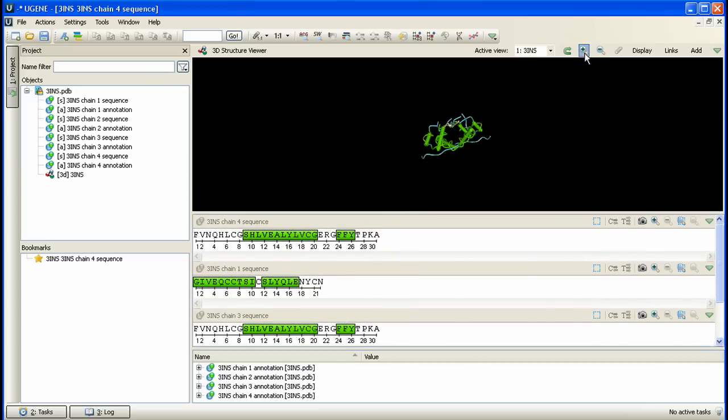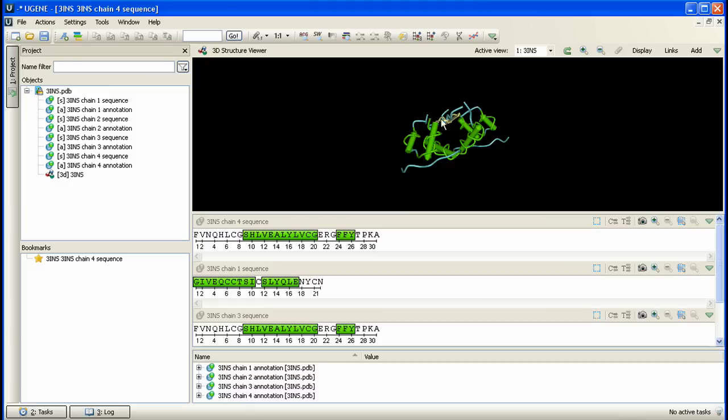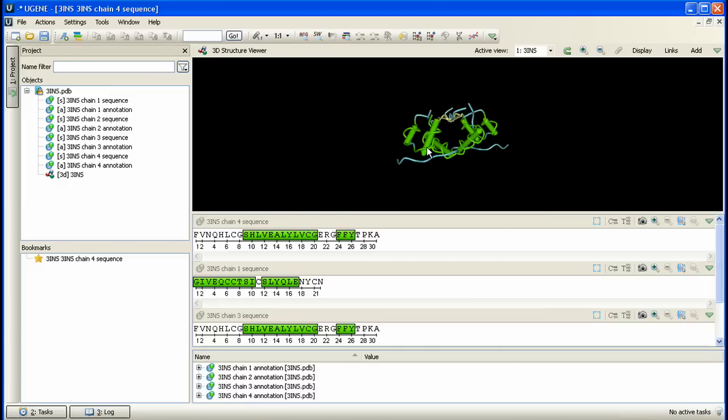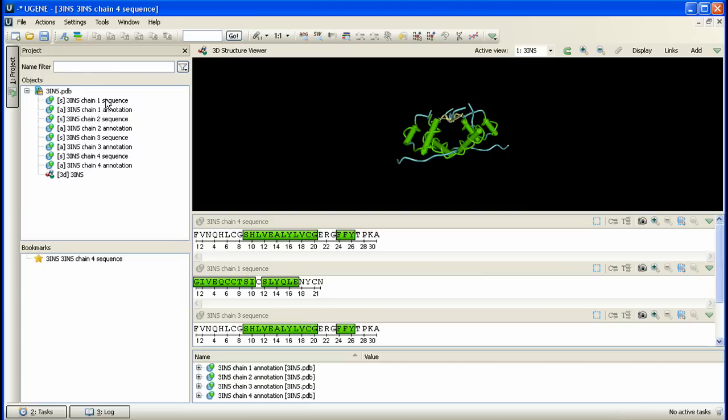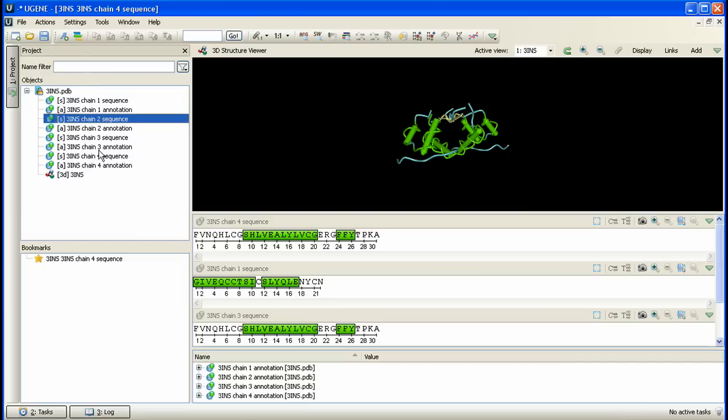The document contains 3D macromolecular structure data. Its view is represented at the 3D structure viewer area. Also, the document contains related sequences and annotations. We can see their list within the open document in the current project view, as well as the 3D structure data item.